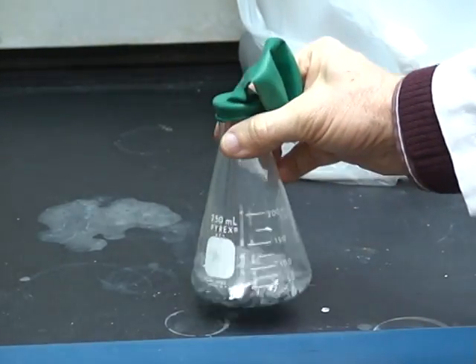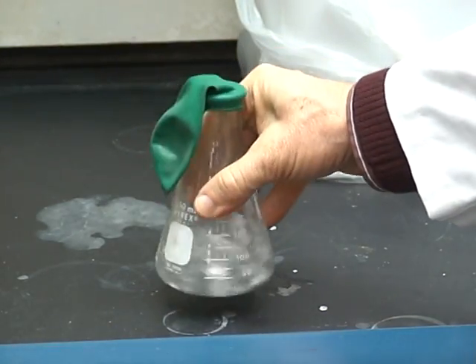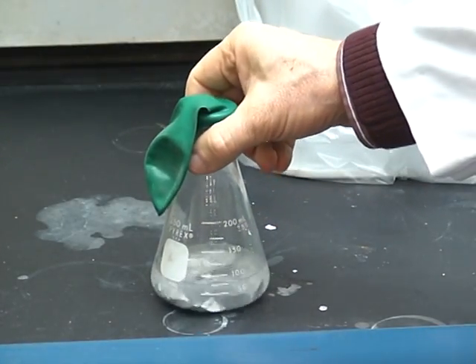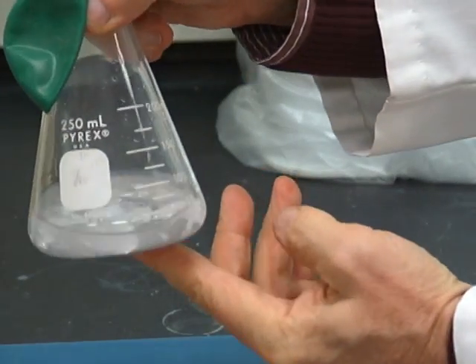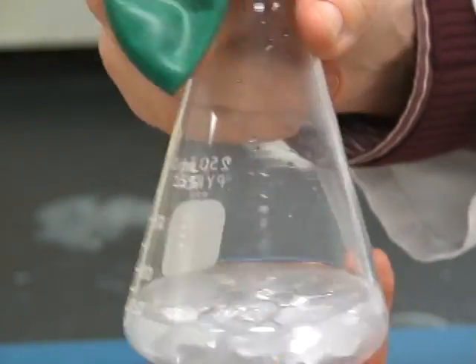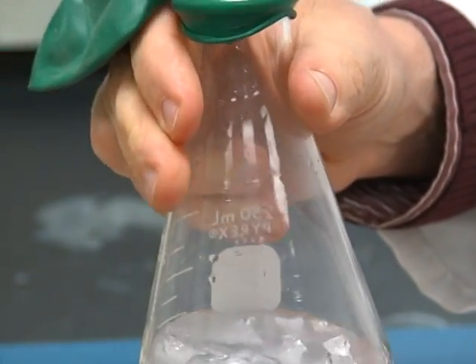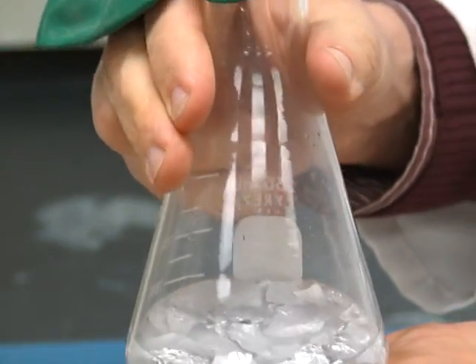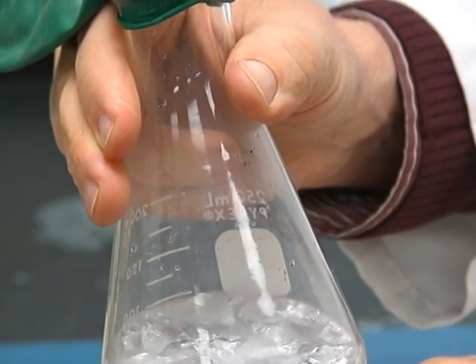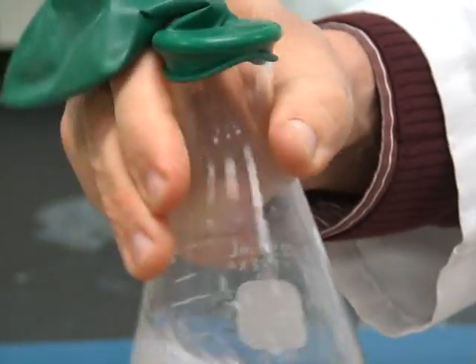Now this is going to take a few minutes. I've got aluminum foil and acid in there. And this is an example of activation energy. But if you look closely, I don't know if you can see it on the video or not, but there's bubbles being produced in there, and that's something that's important to look for. And the flask is getting warmer. Okay, so there's bubbles in there, which is a sign of a chemical change already, something new is happening.